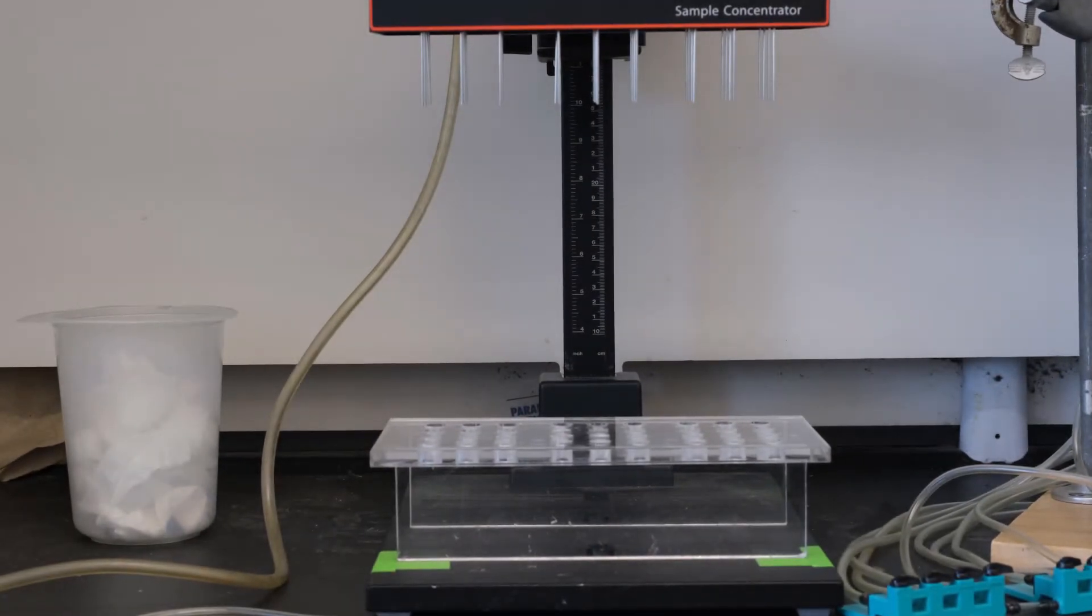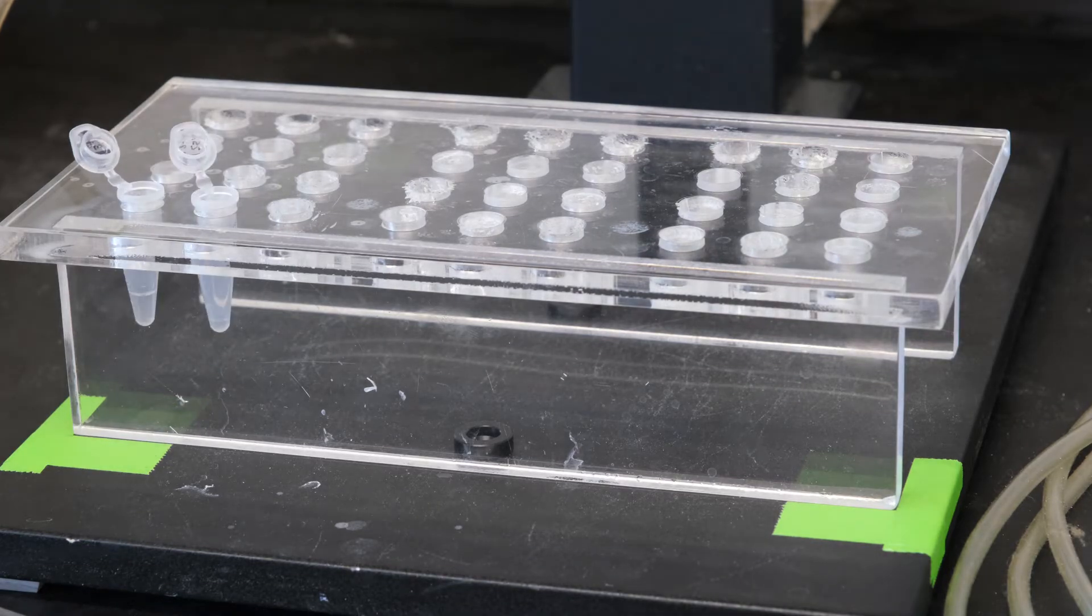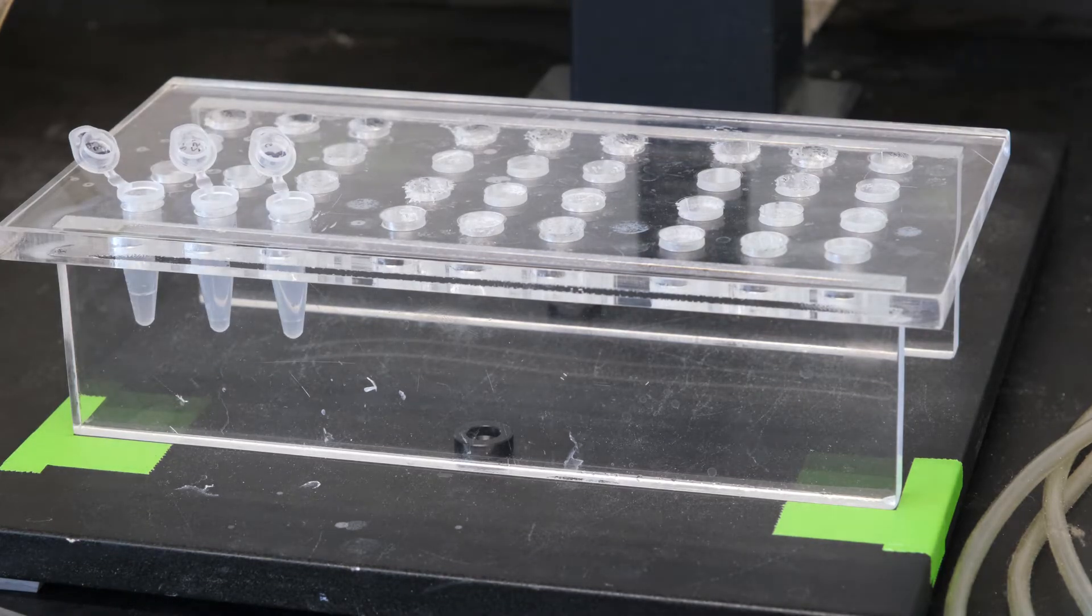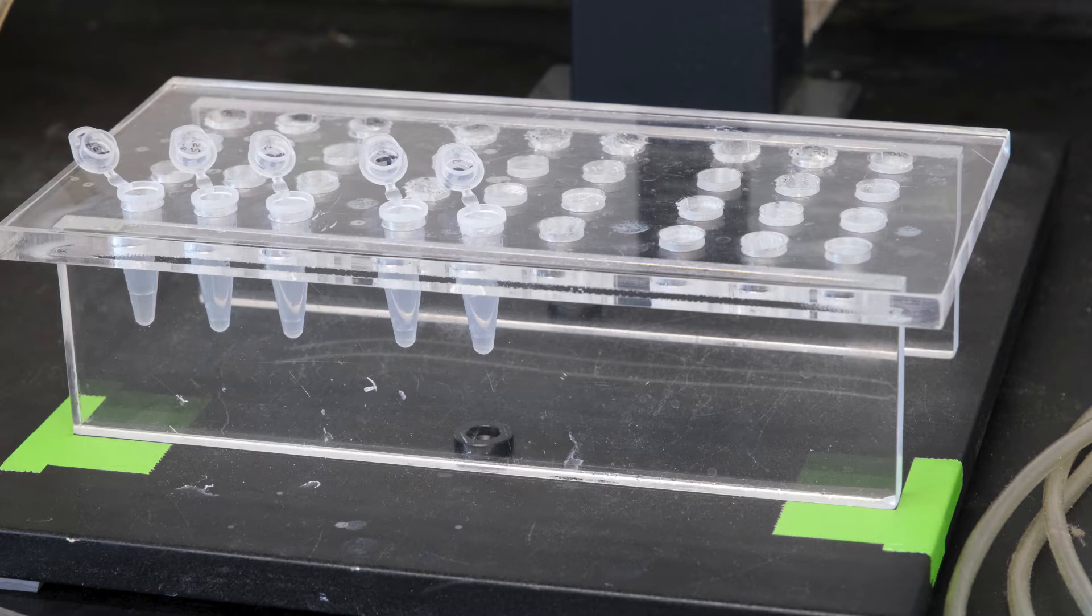The sample concentrator itself consists of a grid of needles and a tube rack. The green tape serves as a guide for positioning the rack so that the needles will sit nicely in your tubes when lowered. Load your tubes into the rack. Make sure to position the lids such that they do not overlap other tube slots, otherwise they will interfere with the lowering of the needles. You may slide the tube rack out for loading if that's easier.